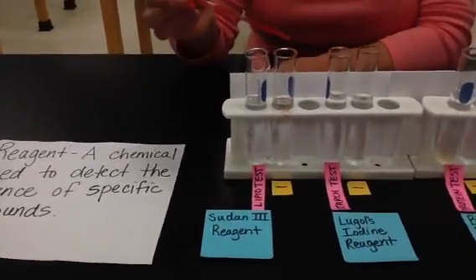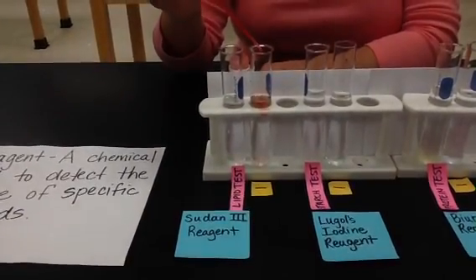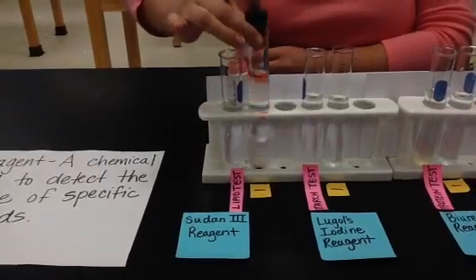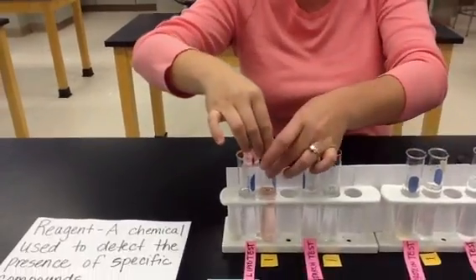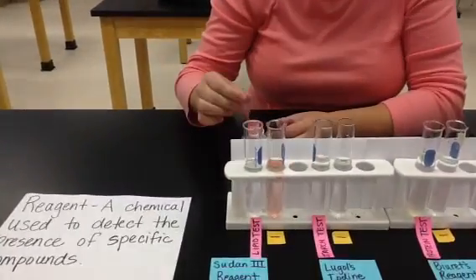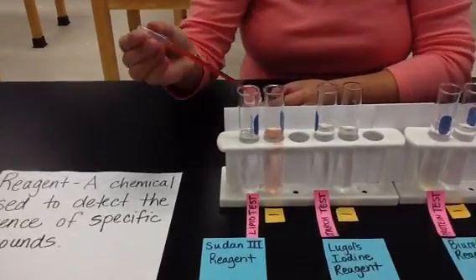So I will need to mix these up as I go. So I'm adding Sudan 3 to our hopefully negative test. And I'm just going to mix it up a little bit. So it's a kind of a pale pink. Okay. Now let's see what it does. We should see some layering with Sudan 3 if there's a lipid inside.